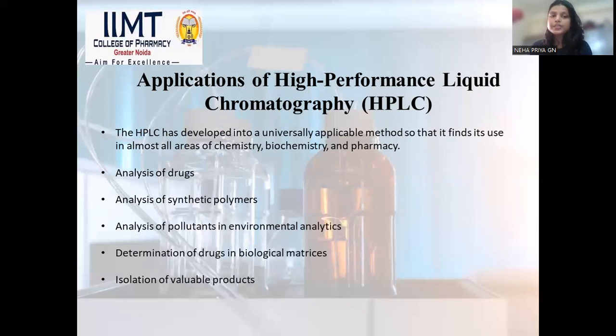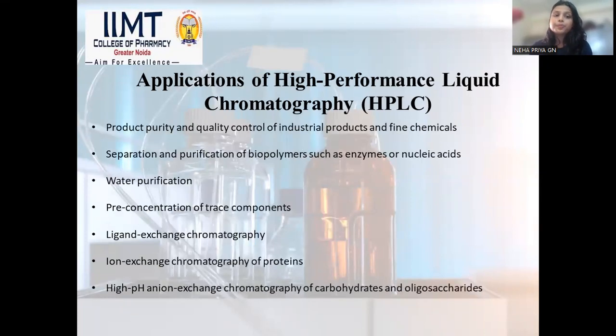In this, we can do drug analysis, analysis of synthetic polymers, analysis of pollutants and environmental analytics, determination of drugs in biological matrices, isolation of various valuable products, product purity and quality control of industrial products, separation and purification of biopolymers, water purification, pre-concentration of trace components, ion exchange chromatography of proteins, and high pH anion exchange chromatography can be used in the separation of carbohydrates and oligosaccharides. So basically, these are the mentioned applications of HPLC.